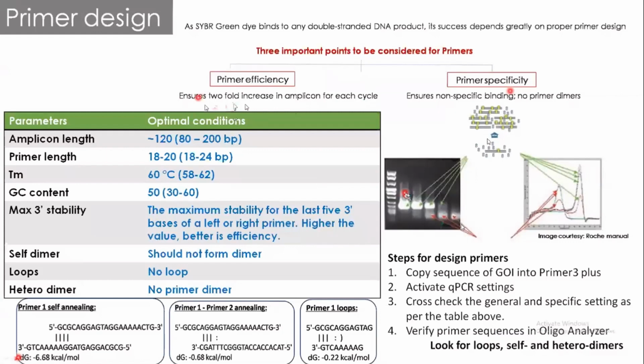curve. If you are getting a melting curve at around 62, 63 degrees Celsius, and then if you see the intensity in the other curve, you will see that 1.4, 1.8, 1.4. If you are seeing 0.1, it indicates that it is a primer dimer and it is not the specific amplification. However, in this particular case, you can see that there is a small dimer, and in the fourth example, either it could mean that there is a non-specific binding, otherwise it's a primer dimer along with your gene of interest. So these two things we need to take care of.